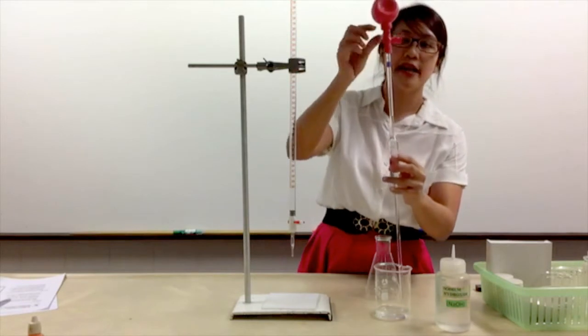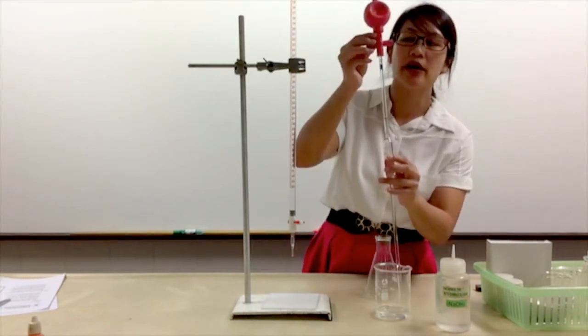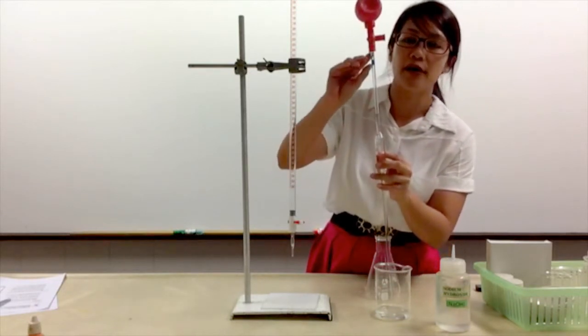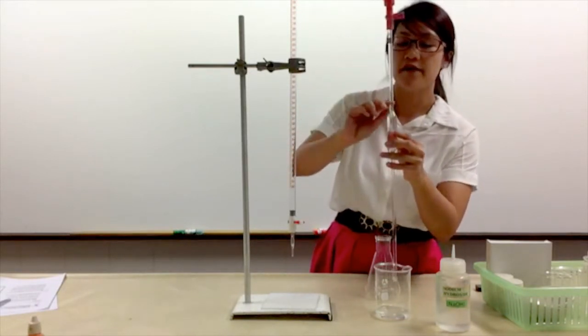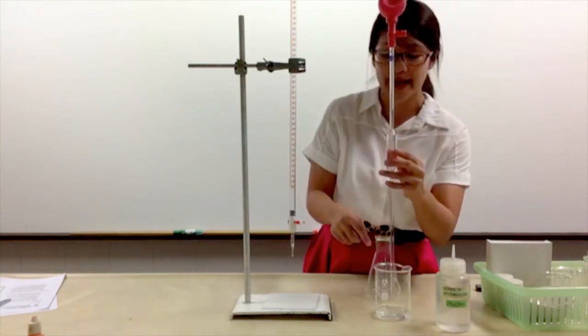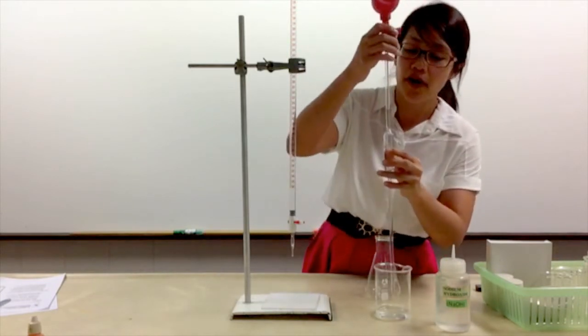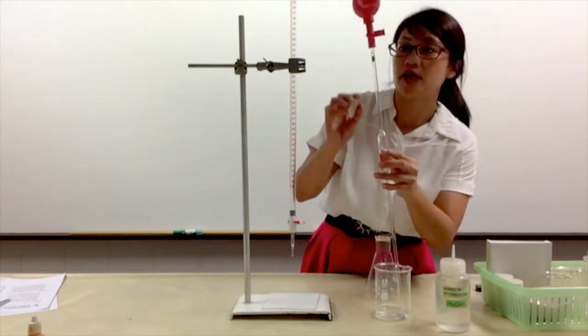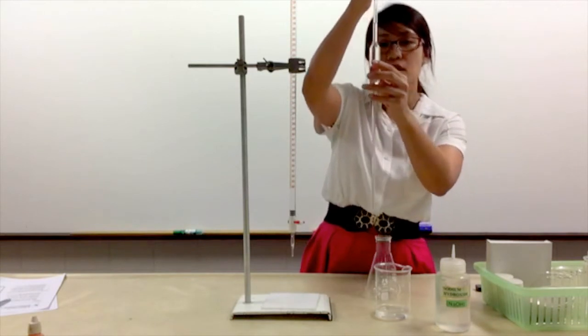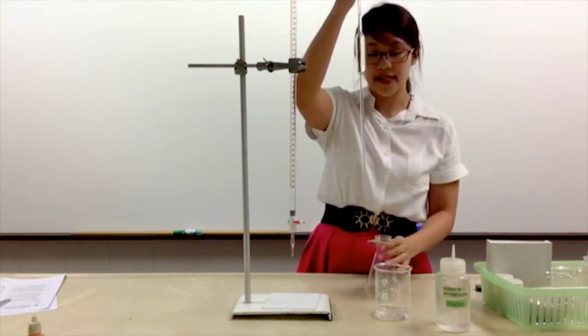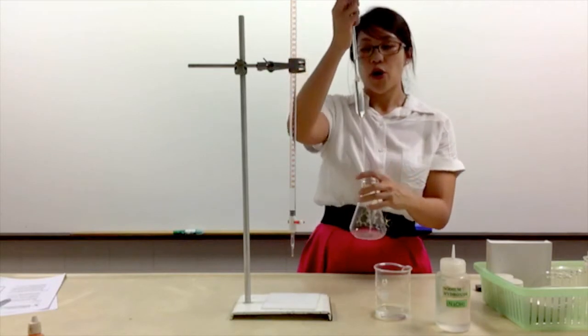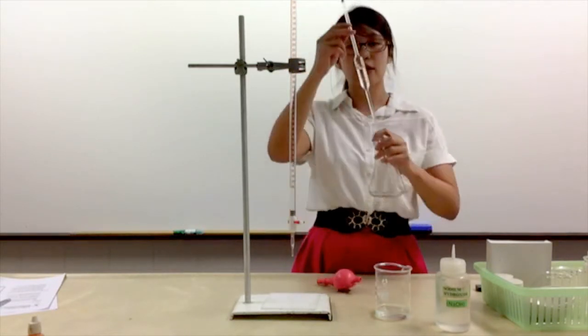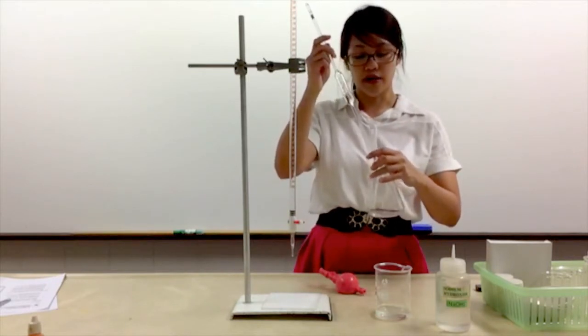What you can do is press S - if you look carefully there's a letter S - S will allow the liquid to move upwards. If you have overshot and you would like some of the liquid to flow back into the beaker again, you press E gently and the liquid level will start to fall. Once you have measured out 25 cm³ of acid, you can remove the pipette filler and the liquid will start to drip into the conical flask.